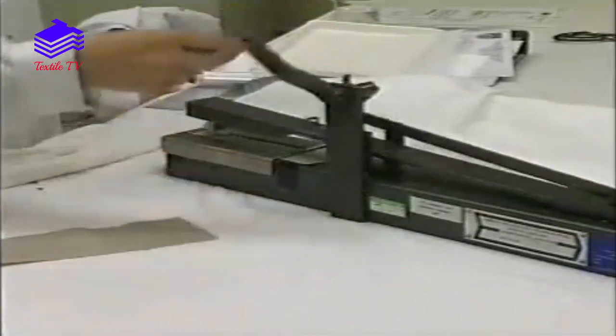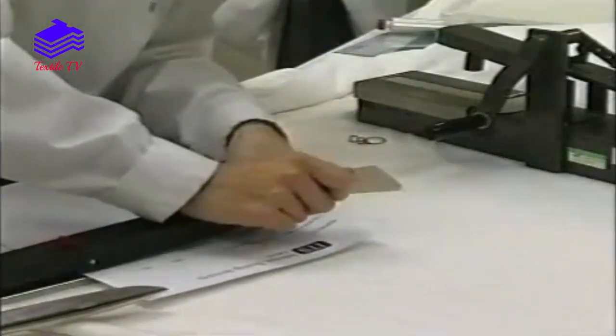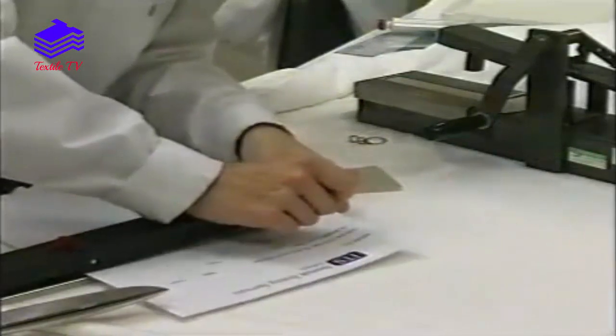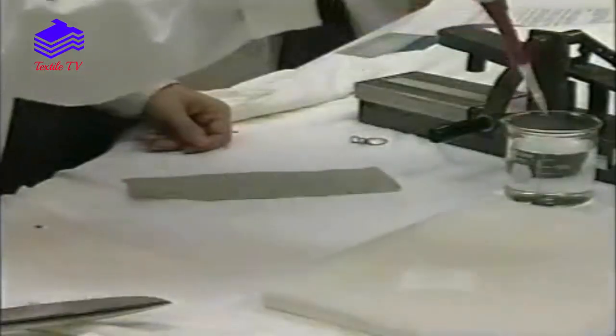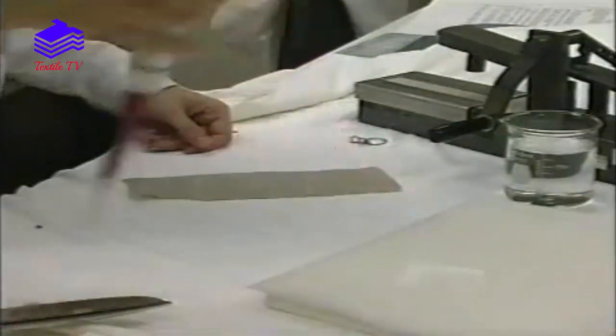After the prescribed number of rubbing cycles, the cotton lawn is removed and mounted on a card. The test is repeated on a new area of fabric using a wet piece of cotton lawn.